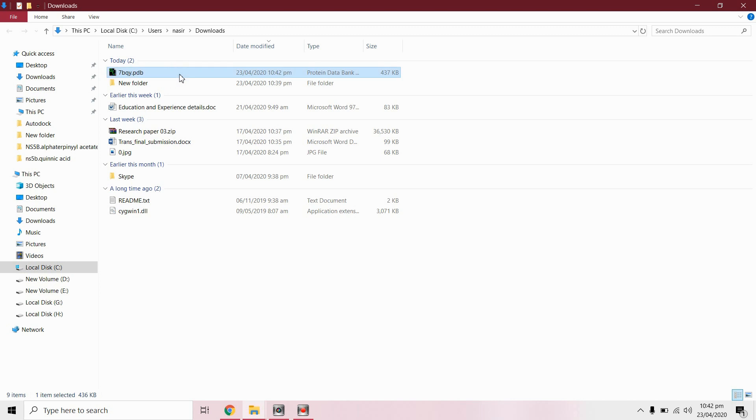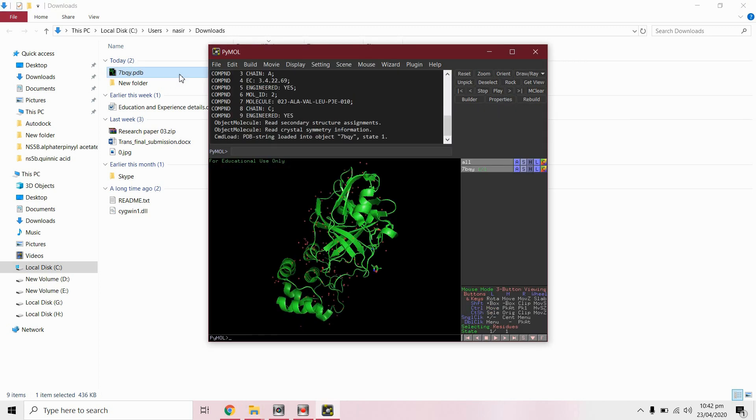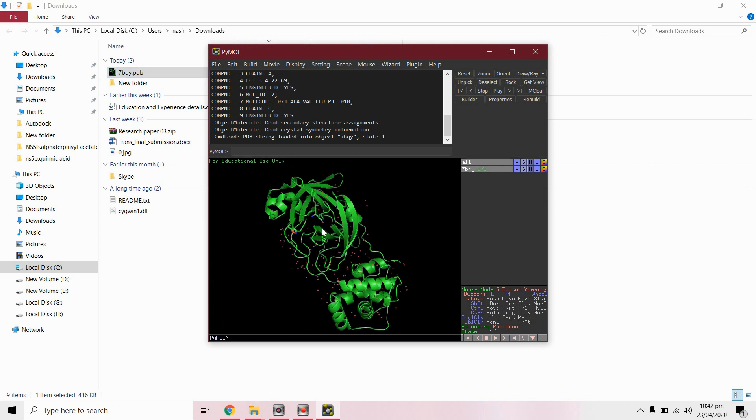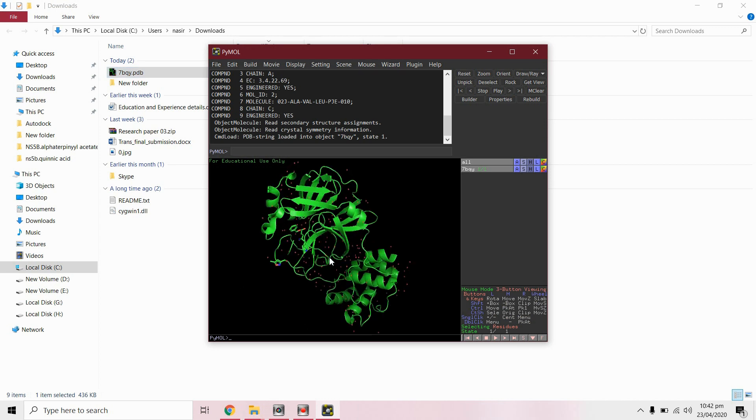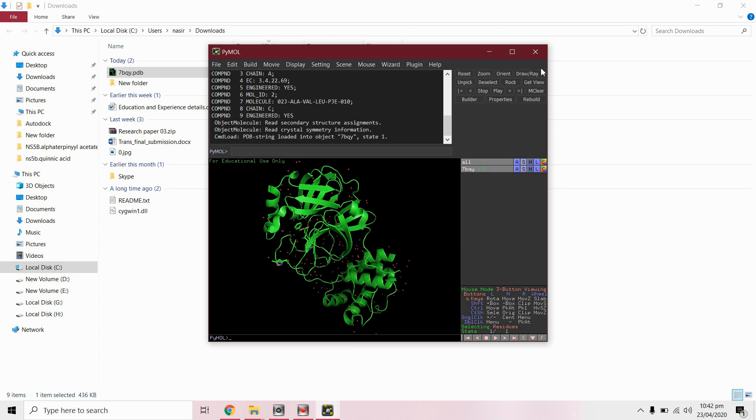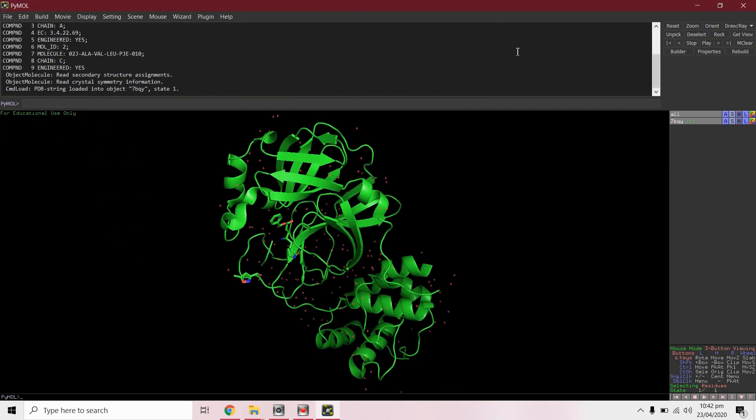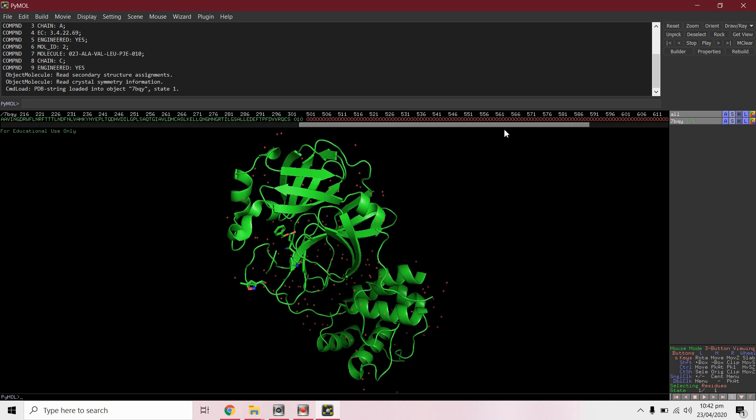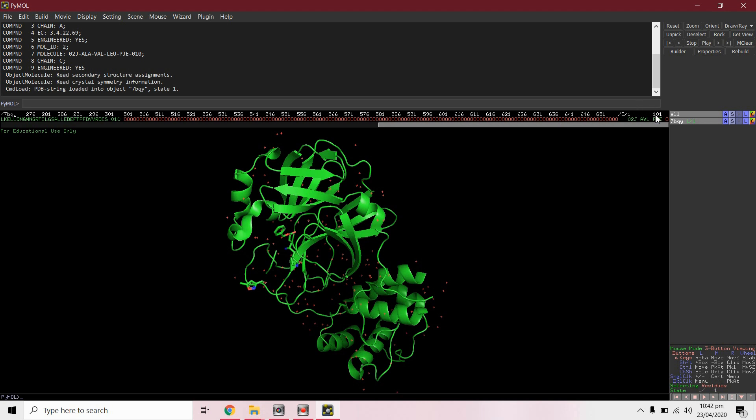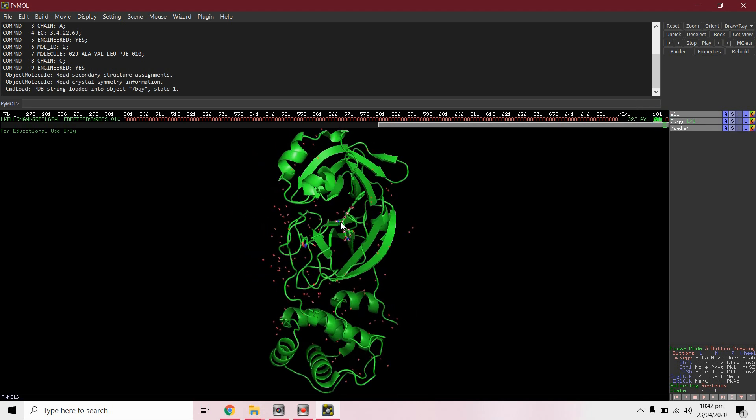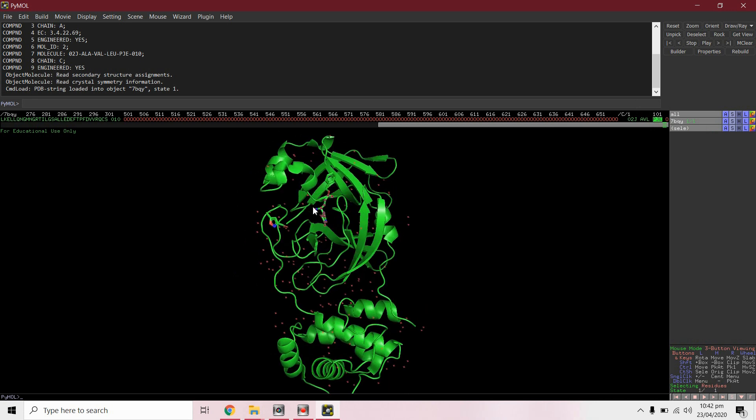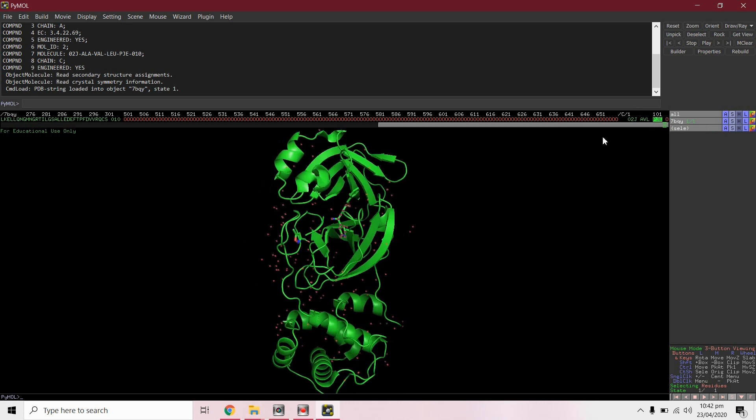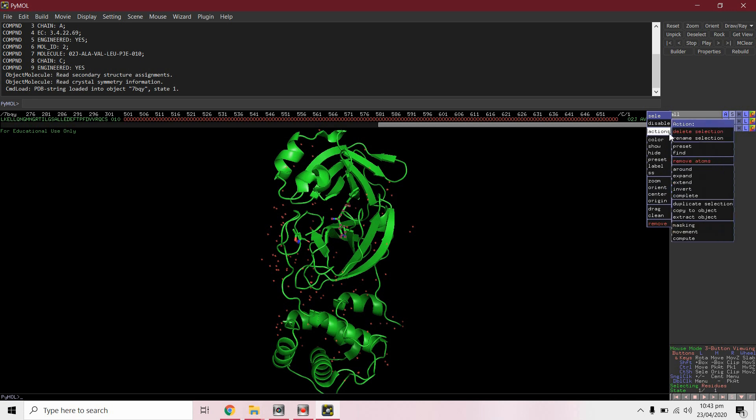First we will separate the ligand and ligand-protein complex. We will separate the ligand and protein files by PyMOL. Click on the sequence. You can see this is ligand. Right click, copy to new object.